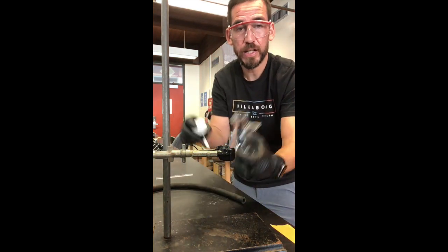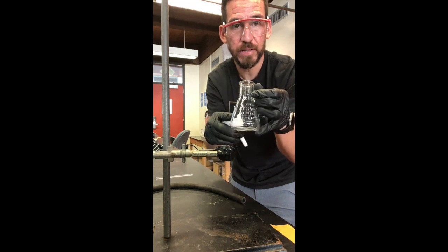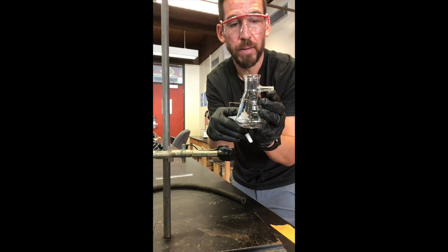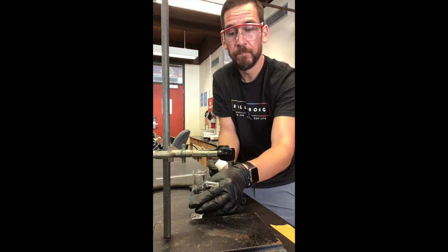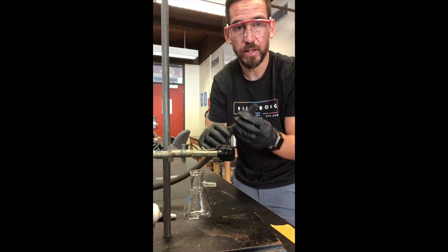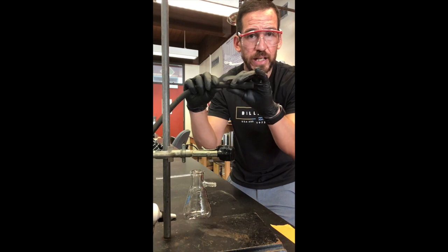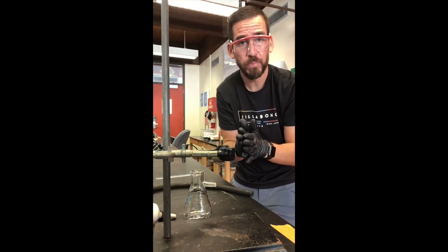Now what we've also got is a vacuum flask. It looks like an Erlenmeyer flask, except it's got this little arm and these little bumps right here, which is usually where you want to put a vacuum hose. Okay, what does a vacuum hose look like? It looks like this. It's different than a water hose in that it's really rigid rubber, and so it won't collapse on itself when you pull a vacuum.